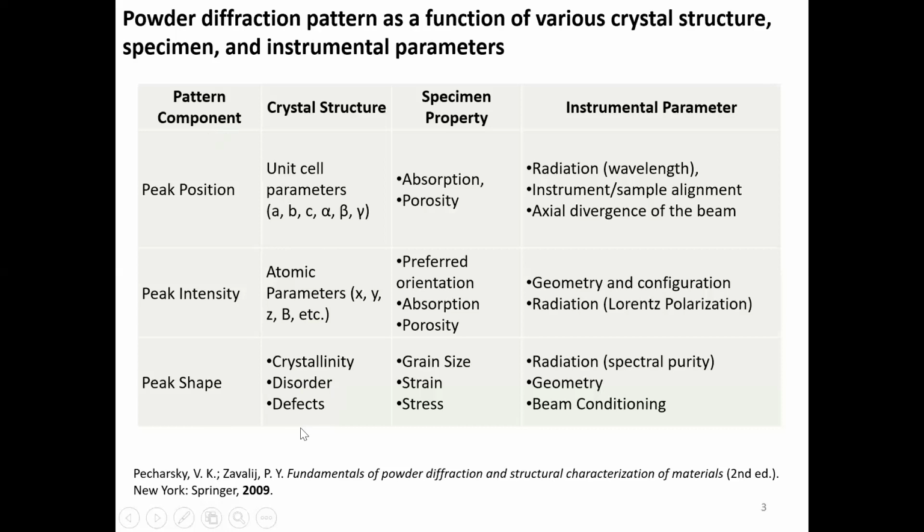Unlike single crystal XRD, where after measurement you will get a crystal information file that contains all the parameters given here, in the case of PXRD we only get an ASCII file or line profile. So we refine, and for that Rietveld refinement is a well-known simulation package.